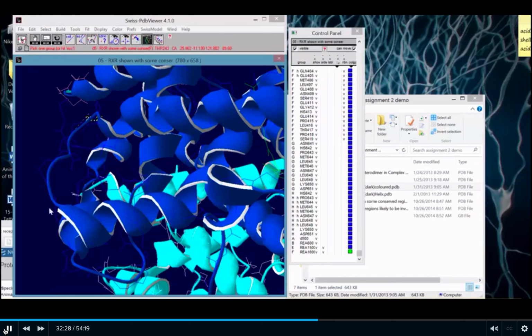So ideally, I'm going to hypothesize that a number of large mutations here, from small residues to larger ones, will actually cause a kinking of this particular strand. So I'm going to click a residue. When I do that, I get a list of things that come down. These are all the different residues. So I'm going to go to, oh, it's loading for some reason. I'm going to go to a tryptophan.